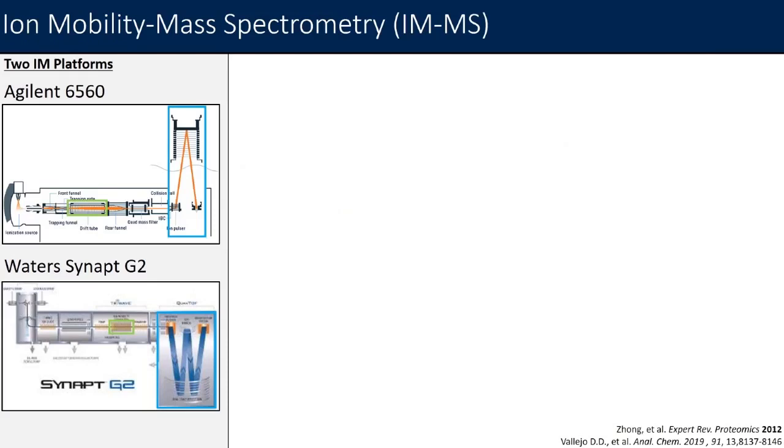What will be important for our conversation later is that the positions of the analyzers here that I'm coloring in green, if we can see my mouse, the ion mobility analyzer located here and here, are at different points inside the instrument. And as we start to compare and contrast these instrument platforms throughout my presentation, that'll become important, I think, to keep in your mind.